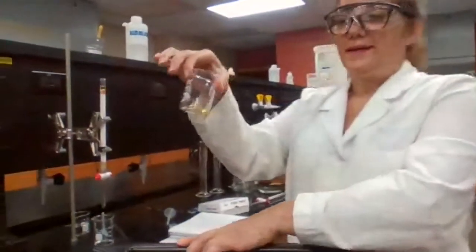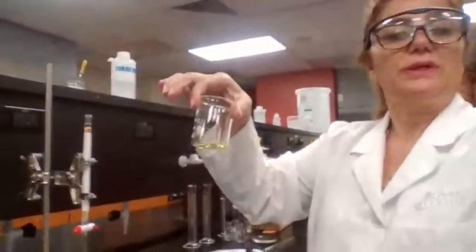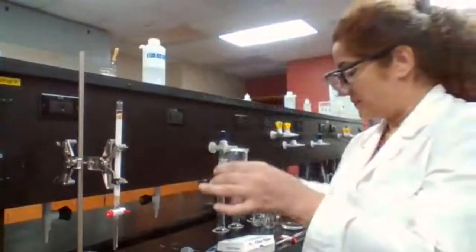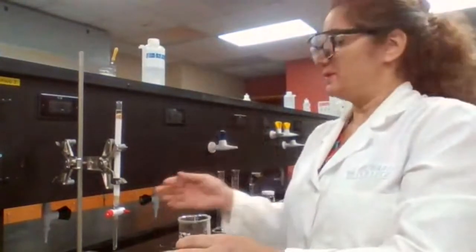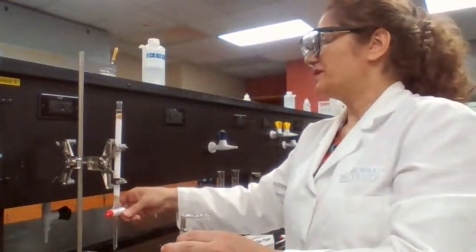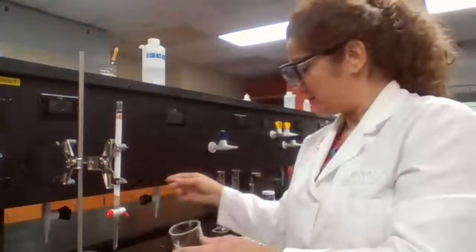Okay, I dissolved the sample or the mixture in toluene. And what's my next step? Please give the steps because I want you to tell me what to do. But I will repeat what I'm doing after you tell me what to do next.